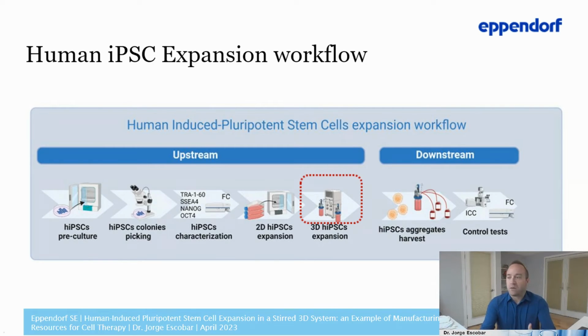So after obtaining the amount of cells to prepare the inoculum for both bioreactors, the next step was the inoculation process and the iPSC expansion in suspension.